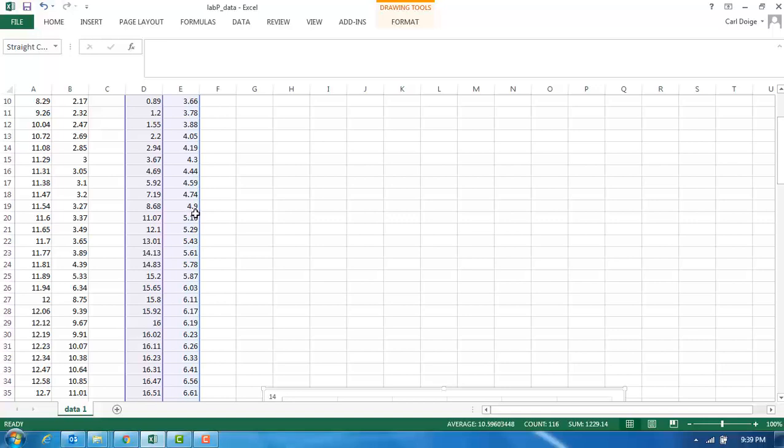Now it's not going to be a pH of 4.8, because 4.8 would actually be a volume considerably lower than 8.68. So we're looking at something like 4.89. So just a slight decrease in pH.